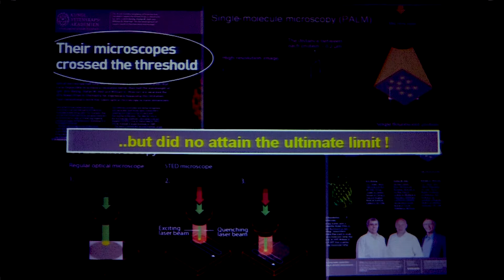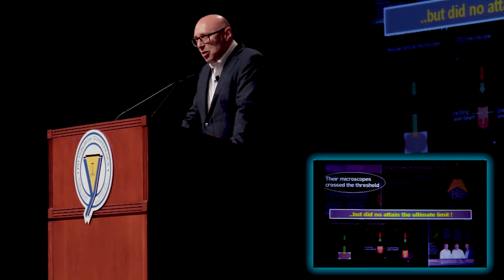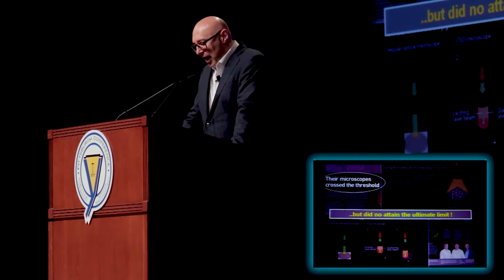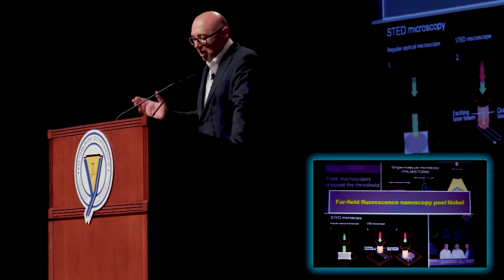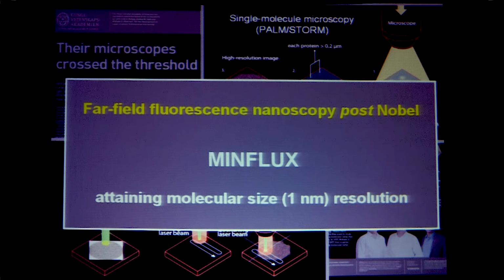And so after having had the honor of sharing the Nobel Prize, I thought, okay, now I have to deliver. And I'm going to show that there is indeed a way to get down to 1 nanometer spatial resolution. So in essence, I'm going to change the title of my talk. I'm calling it far-field fluorescence nanoscopy or super-resolution microscopy post-Nobel, and the subtitle is MINFLUX, that's a new concept, attaining molecular size 1 nanometer resolution.